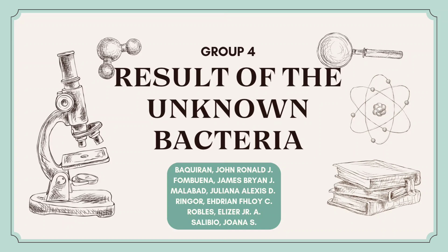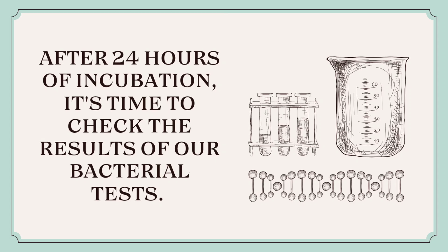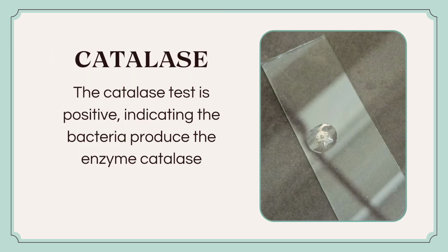Presenting the result of the unknown bacteria by group 4. After 24 hours of incubation, it's time to check the results of our bacterial test. First is the catalase. The catalase test is positive, indicating the bacteria produce the enzyme catalase.